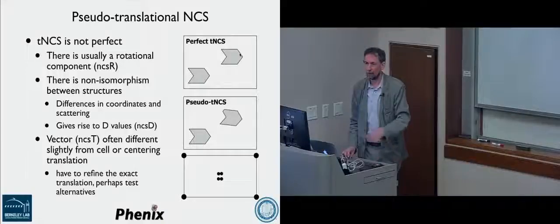That often actually is crystallographic, and comes down to a centering operation. What we typically have is something like this, where two molecules are not exactly the same. It's not just a translation, it's a bit of a rotation. That's more the reality of what you see in these circumstances.